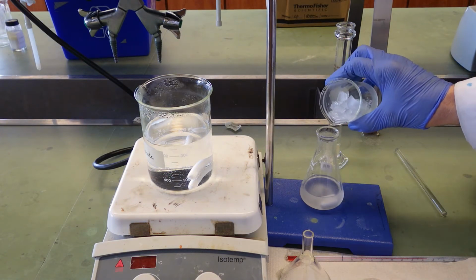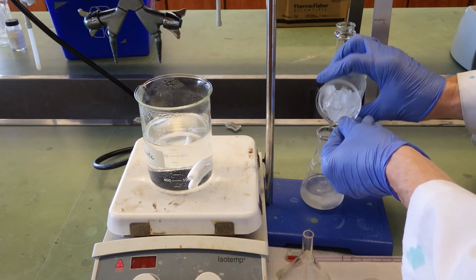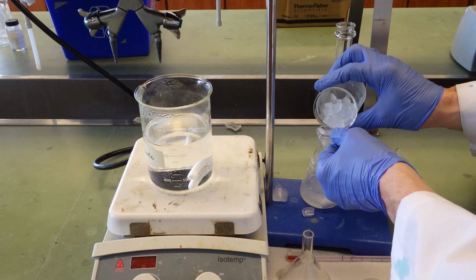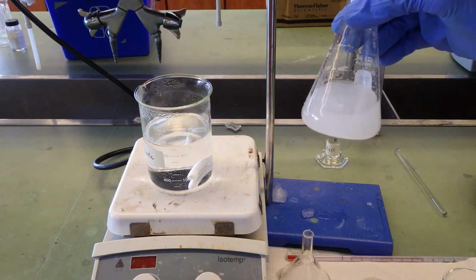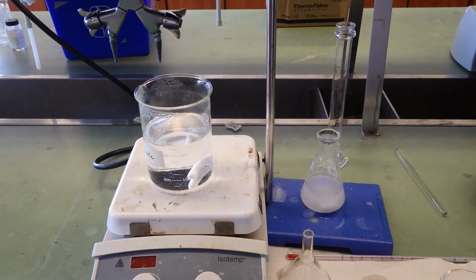We'll add some crushed ice to see if that helps, but if that doesn't work, what we have to do is simply scratch the bottom of the flask with a glass stir rod, and that creates a few particles which serve as nuclei for crystallization to begin on. No solids yet.